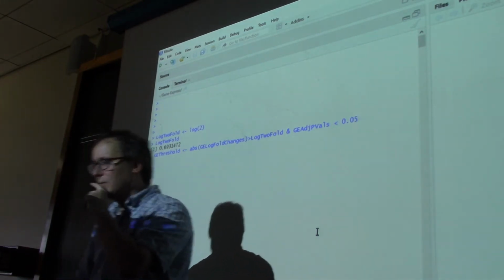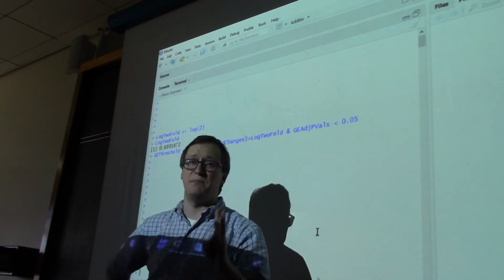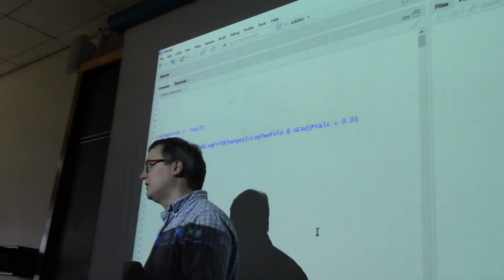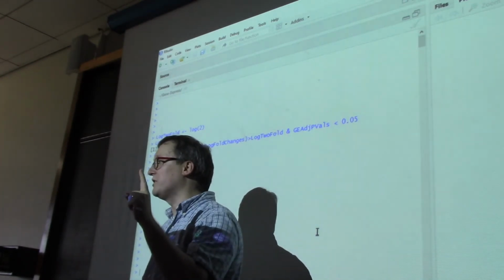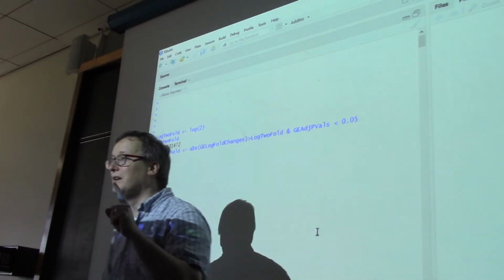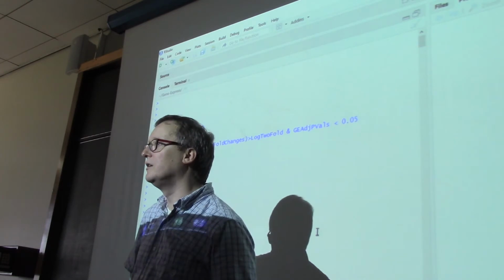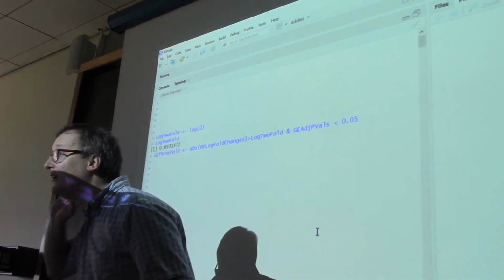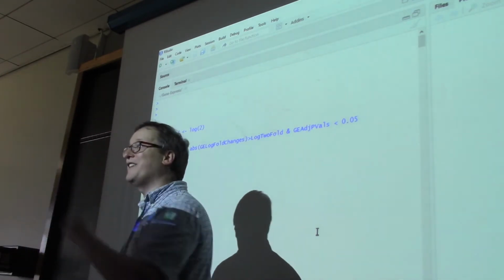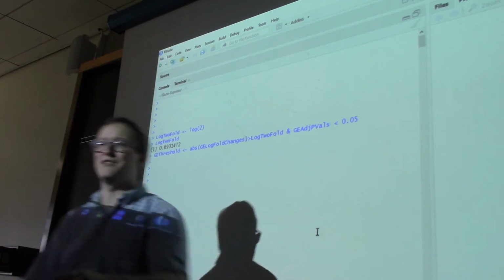So this is the ggplot2 code that I appended to the bottom of the file this morning. All right, so there were two rules that each gene must pass for us to say we care about this gene. First off, we want a p-value that's what? What do we say about the p-value? A nice high p-value, a nice low p-value? What do we want? You want a high p-value? Ah, see, I've already confused things because I've been talking about negative log p-values rather than p-values.